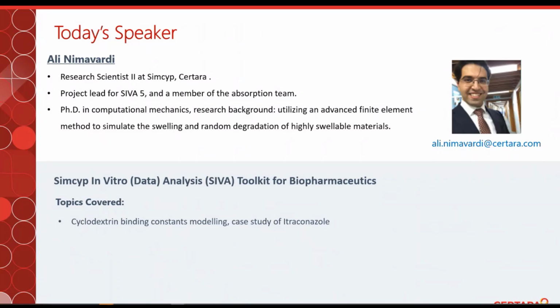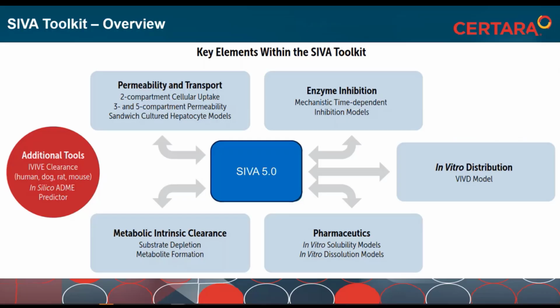Hello, can you hear me now? Yes. Hi everyone, this is Ali. I'm glad that I have the chance to explain the cyclodextrin binding constant modeling, the case study of Itraconazole, to you in this session. I have only one slide to introduce SIVA, and then I move to the actual SIVA software to demonstrate the software and how we develop the model from scratch.